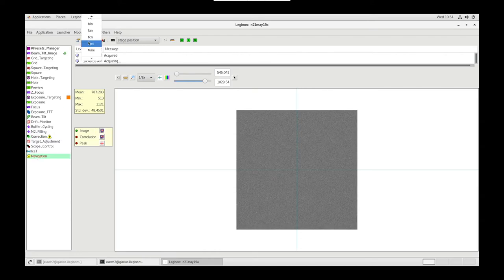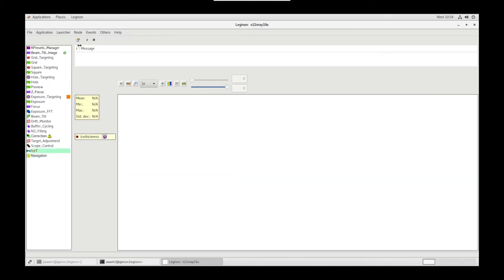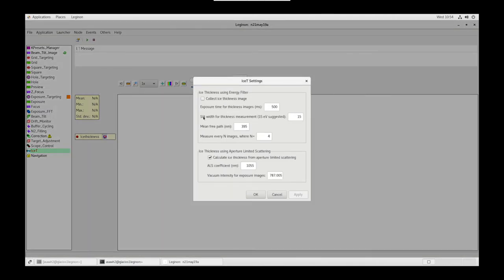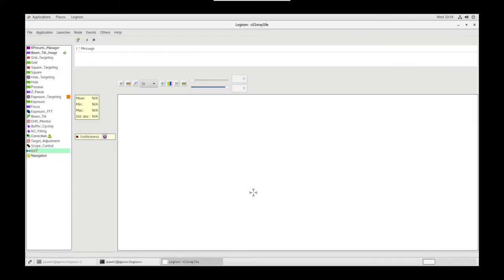Go to Navigation, let's send ENN to Scope and Acquire. Write down or memorize the mean value. Let's go to Ice T node. In Settings, we want Ice Thickness using Aperture Limited Scattering to calculate Ice Thickness from Aperture Limited Scattering. Our ALS coefficient is 1055, and our Vacuum Intensity for Exposure images is that mean value.